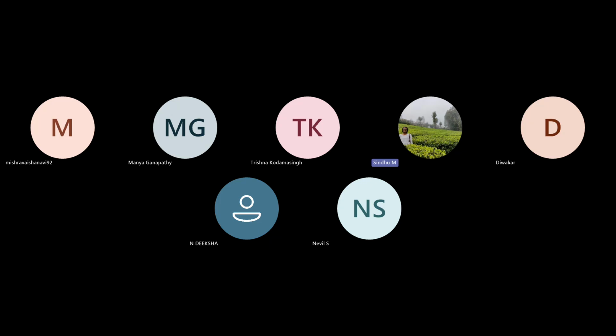Now, let's say we just want the green channel intensity, then you can split the channels. And now on this image, these ROIs can be applied to whatever image that you want.